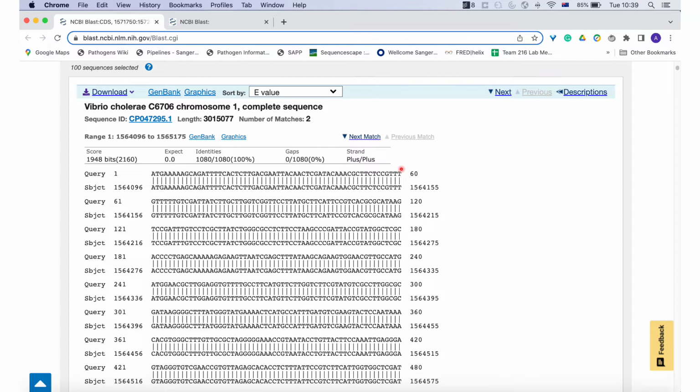And so you can see there's a line for each sequence, and you can see that they're all the same. All the bases are identical based on A, the fact that you can see the bases, and B, this vertical line between all of them. So if we had a mismatch, we wouldn't have that line, and you would see that, for example, this A might be a C.